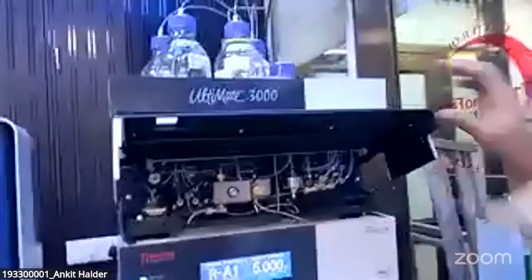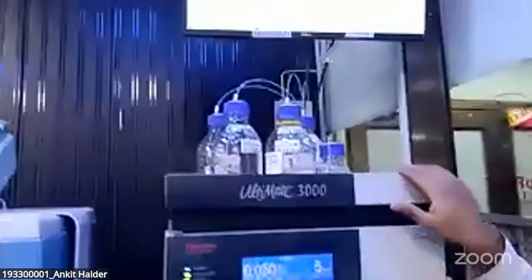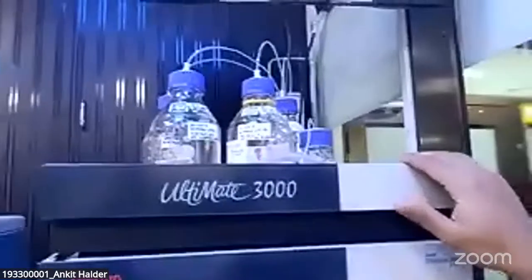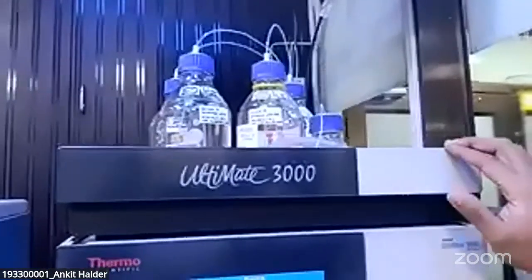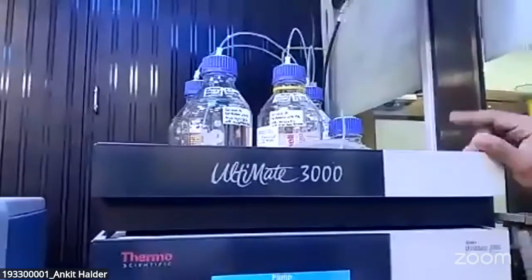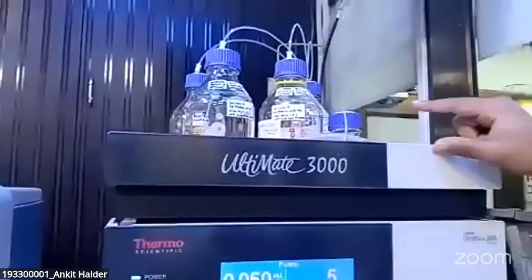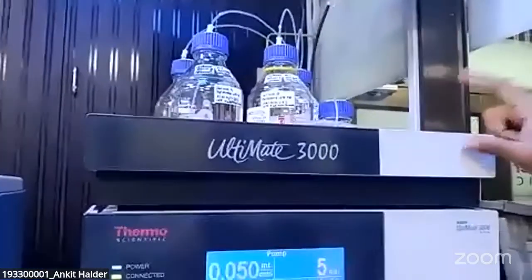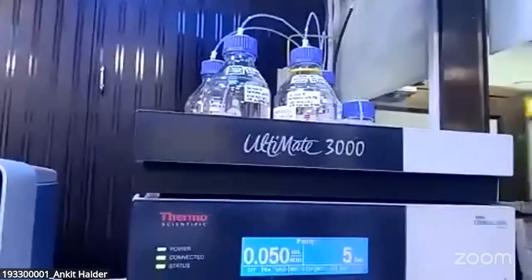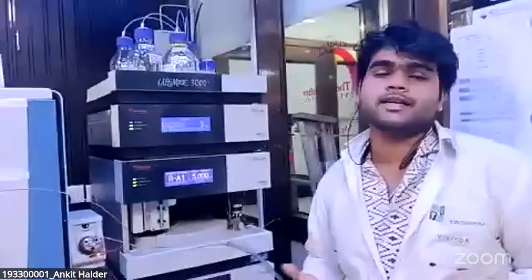Now the final rack is the solvent rack. In the case of lipidomics, you use a quaternary solvent system, and in the case of metabolomics, you use a binary solvent system. So in the case of lipidomics, we use 4 different solvents: the solvent A, B, C, and D. One of the most important features of this mass spec is that it can give us information about the protonated and the deprotonated metabolites or even the lipids.